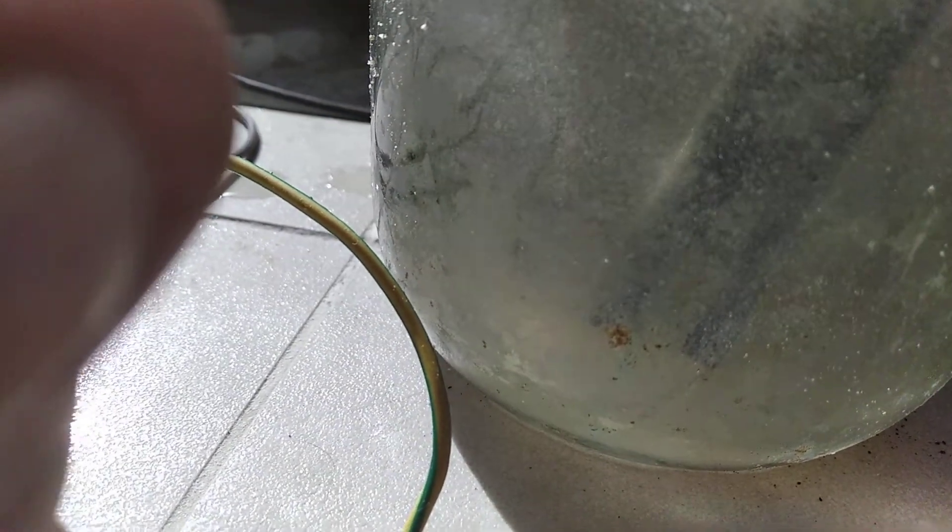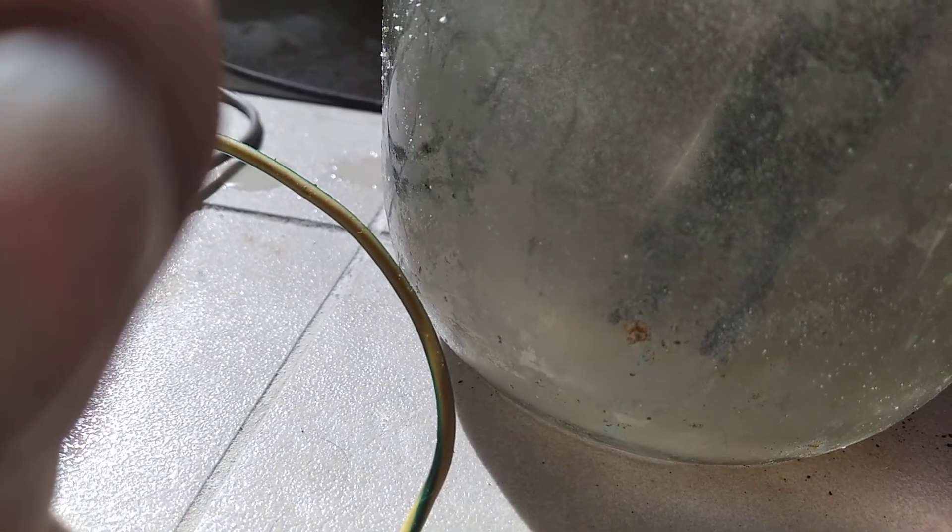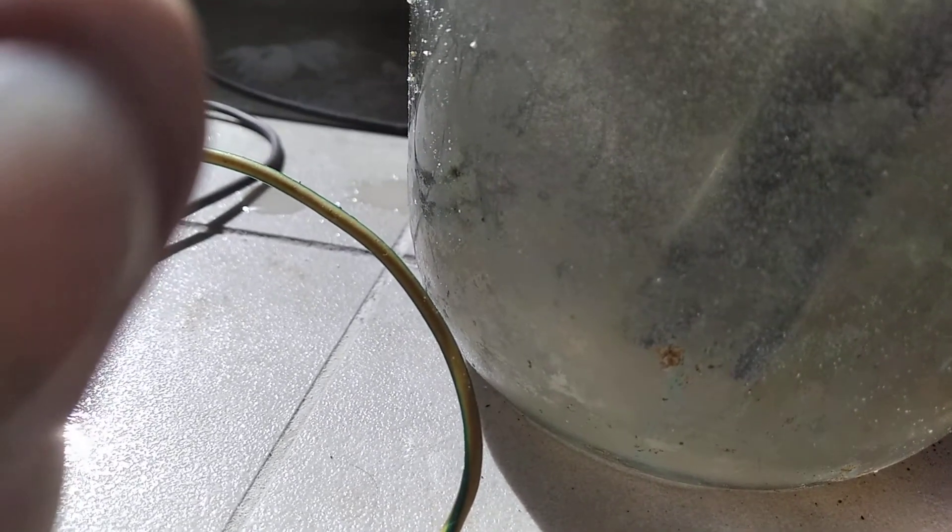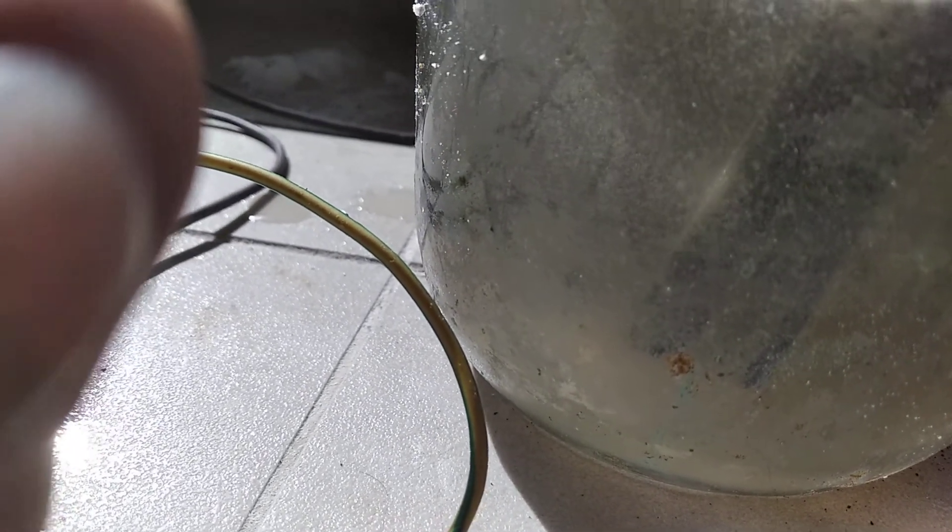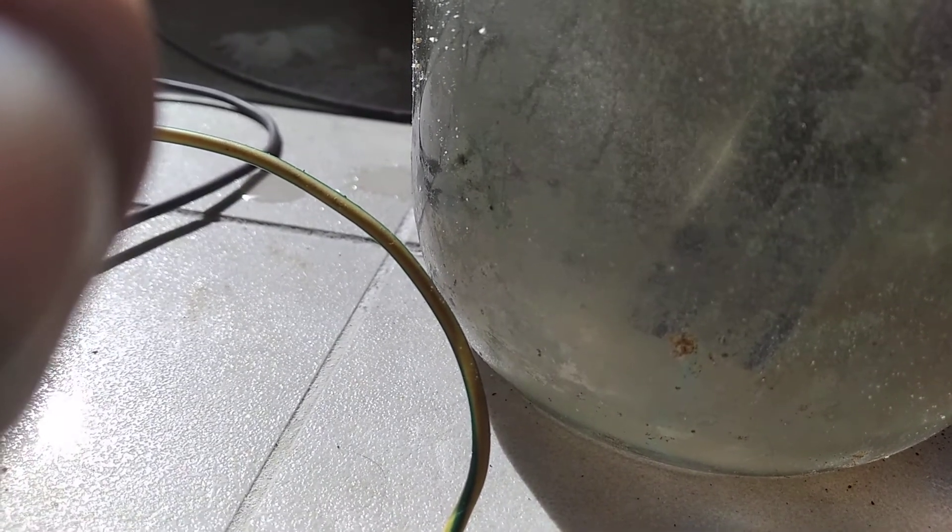So now you don't have to worry about painstakingly adding hydrochloric acid. Instead you can just add a bit of calcium chloride, and when you see the black starting to come out of your anode, that tells you to add more calcium chloride to prevent the degradation of your electrode.